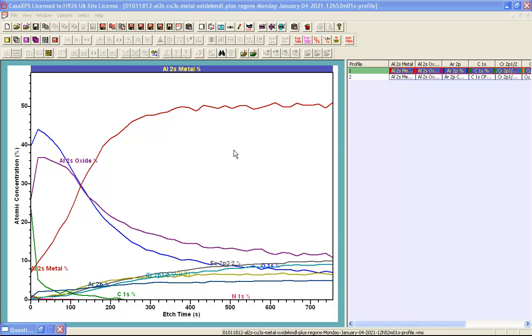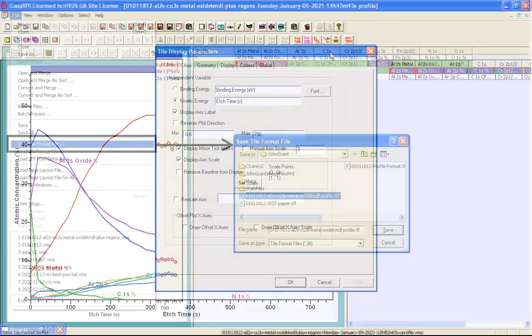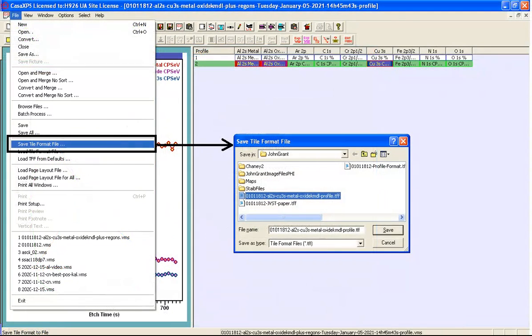When data are displayed in the active tile the set of display options that have been defined using the parameters and options on the tile display parameters dialog window can be saved as a TFF file.